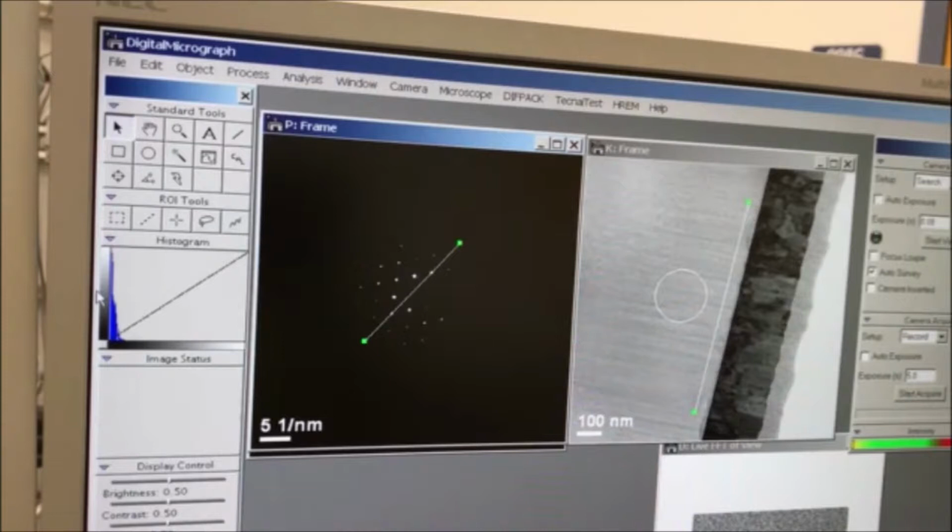And so the way we do it is we use a little trick. It's a little difficult to actually show this in the video, so I'm going to describe it first. So right now, I'm basically perfectly aligned with the zone axis. So what I'm going to do is deliberately adjust my alpha tilt so that I'm not aligned with the zone axis.